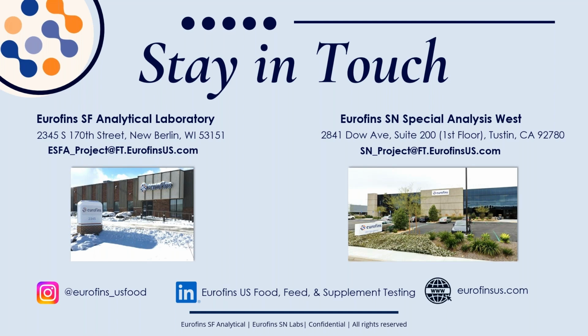I think by far the most common inquiry we see are leaking aluminum cans. There are just so many ways that things can go wrong with an aluminum can. Most often we see corrosion. The client sometimes thinks, oh, our formulation is just too aggressive, but in reality, as I showed in one of the case studies, we have pinhole leaks that come from things like the inclusions that I demonstrated. And also we see seams that don't meet specifications, et cetera. So by far the aluminum cans are the biggest issues, although we do see a lot of inquiries for things like off color, off odor, can or bottle bloating, where the packaging is deformed or just simply not conforming to specifications and is in need of investigation to find the root cause of that failure.